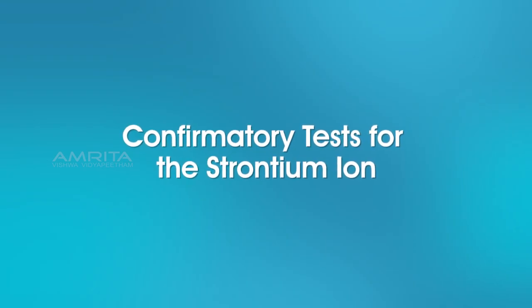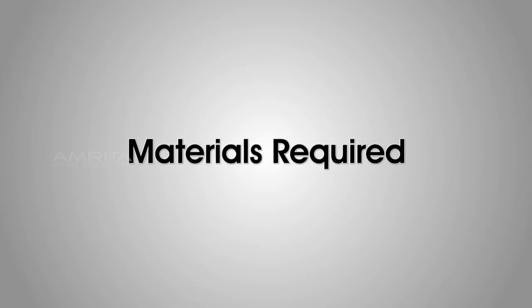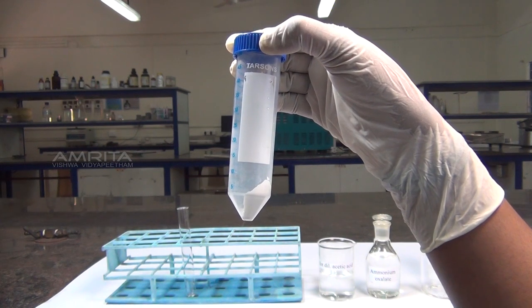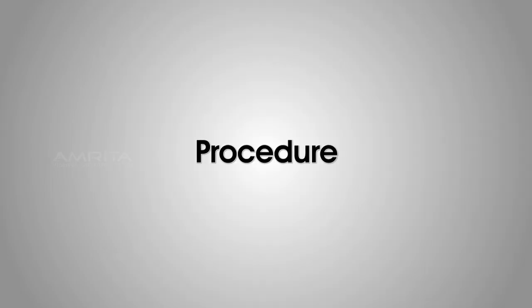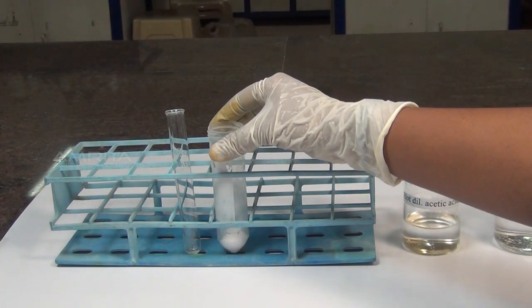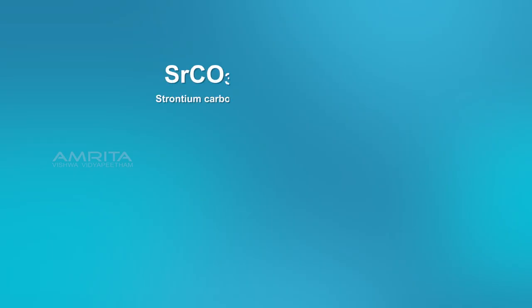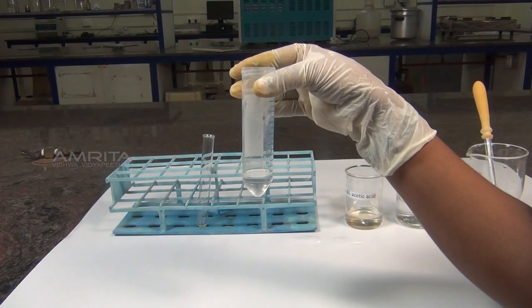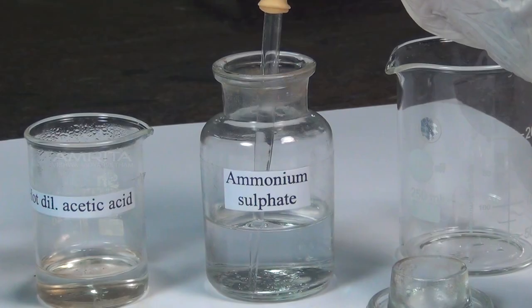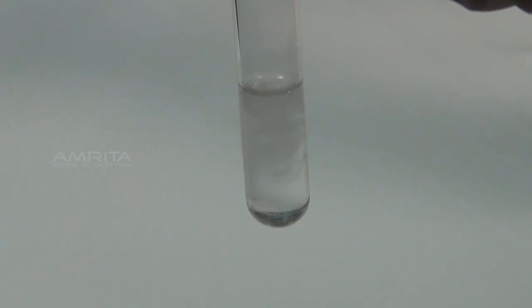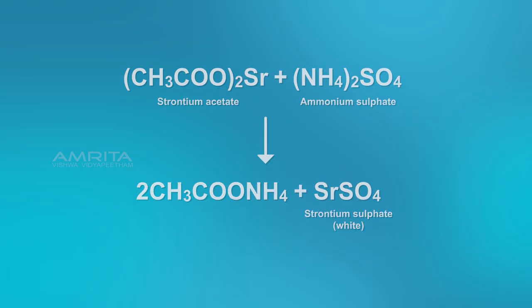We look at the confirmatory tests for the strontium ion. Ammonium Sulphate Test. Materials required: precipitate obtained in the group analysis, hot dilute acetic acid, ammonium sulphate solution and droppers. Procedure: take the precipitate obtained in the group analysis. Add a small quantity of hot dilute acetic acid using a dropper. Strontium carbonate reacts with acetic acid to form soluble strontium acetate. Transfer this solution into a test tube. Using another dropper, add a small quantity of ammonium sulphate solution. Strontium acetate reacts with ammonium sulphate to form a white precipitate of strontium sulphate.